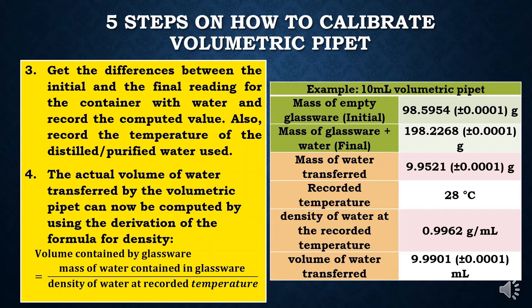Step 3: get the difference between the initial and the final reading for the container with water and record the computed value. Also record the temperature of the distilled or purified water used. Getting the difference between initial and final reading gives a computed mass of water of 9.9521 grams. The recorded temperature of water is 28 degrees Celsius.